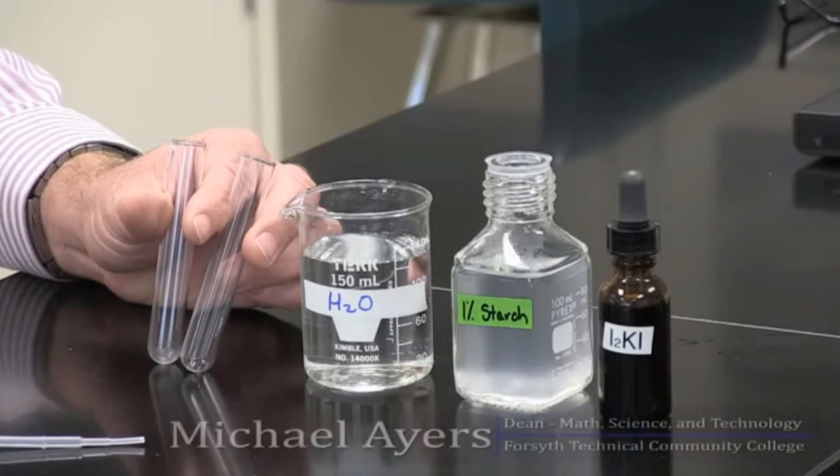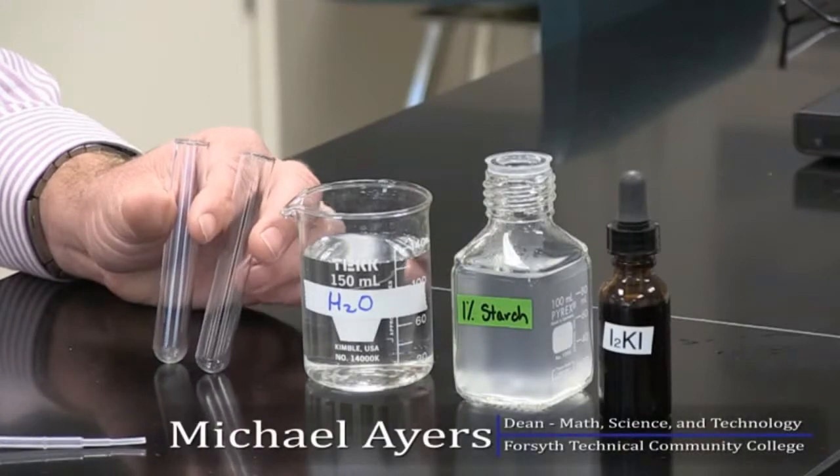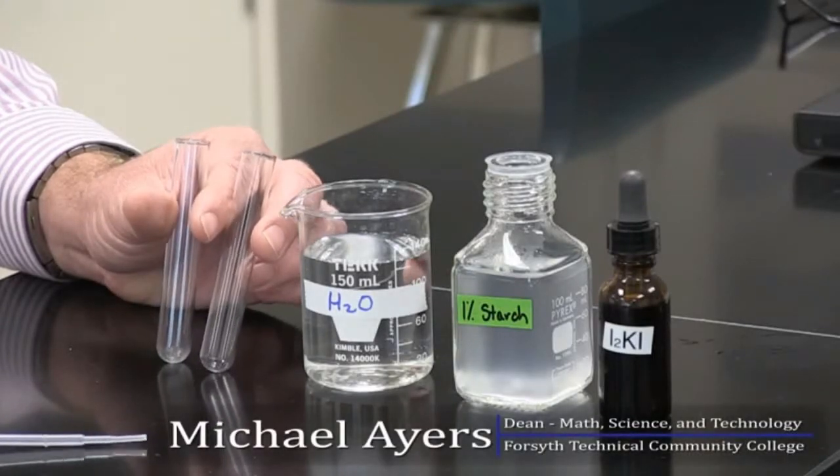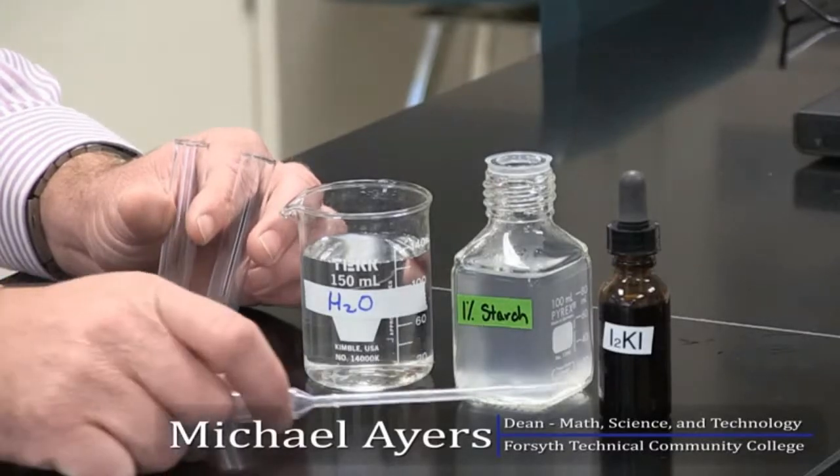So we want to do a test now that indicates the presence of a polysaccharide called starch. And the indicator that we use for this is something called IKI, it's just an iodine compound.